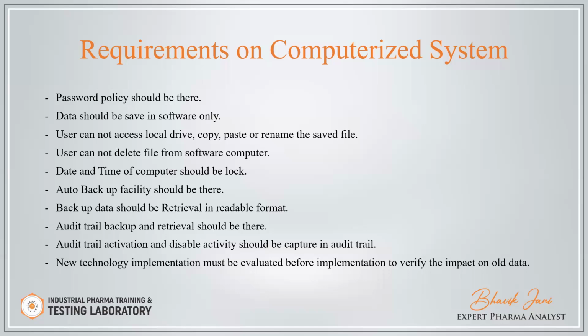New technology implementation must be evaluated before implementation to verify the impact on older data. It means whenever you upgrade your system, you have to define the impact on your data. The old data impact should be evaluated before upgrading to the new system.